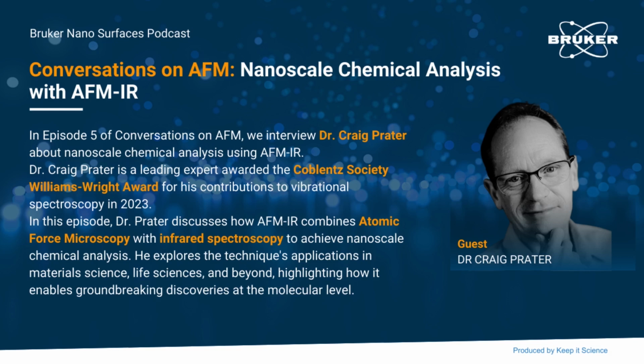Well, multimodal imaging is absolutely a hot topic, not just in AFM, but also in optical microscopy and other forms of microscopy and spectroscopy. And I think there's broad recognition that the more independent channels of information you can use to understand a sample deepens your knowledge and the potential to use that knowledge to advance technology, advance the development of consumer products, advance innovations in human health, et cetera.